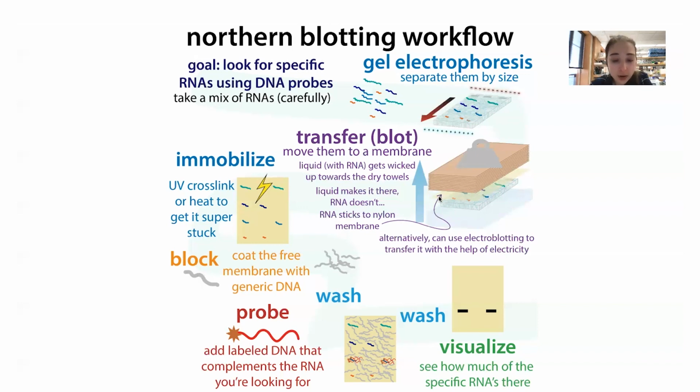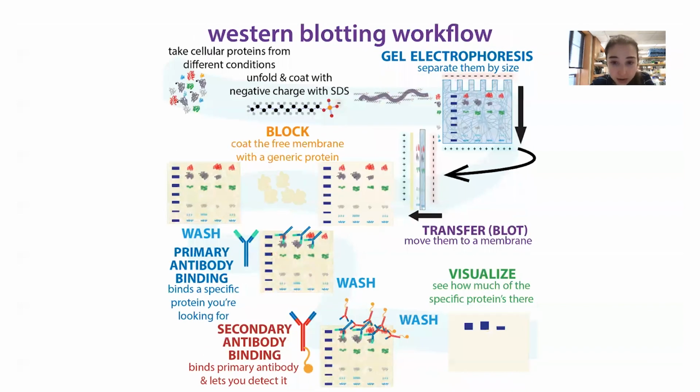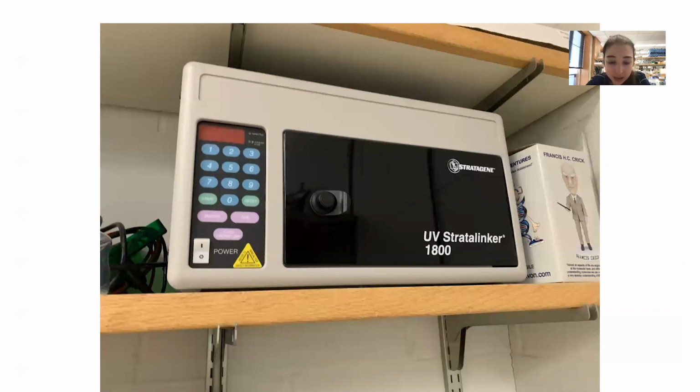So at this point with your Western blot, your proteins stick pretty well to this nitrocellulose membrane. Your proteins are all denatured. You've removed the SDS, so now these proteins are all unfolded and all their hydrophobic parts, the parts that don't like water, are exposed. And so they're going to glob onto the membrane and stick okay. But in the case of DNA and RNA, you typically want to somehow lock them in place to get them to stay still better.